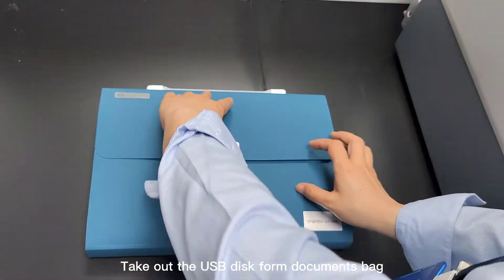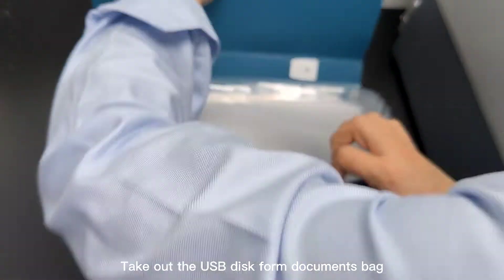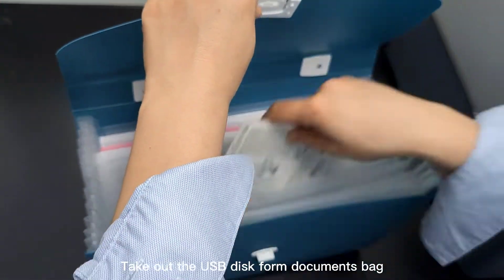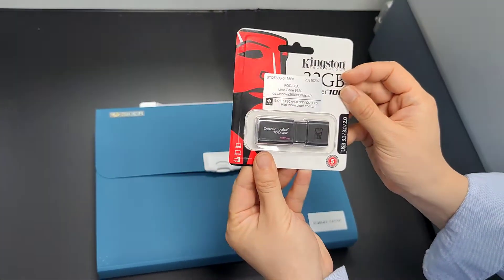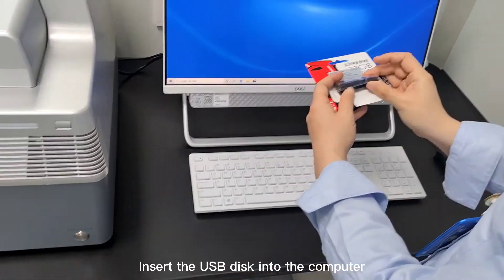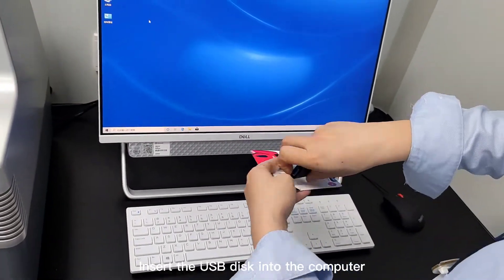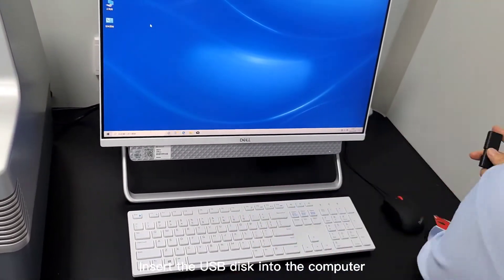Take out the USB disk from documents bag. Insert the USB disk into the computer.